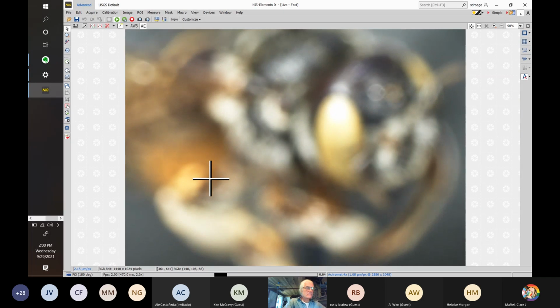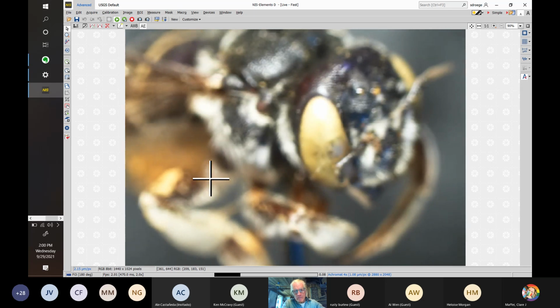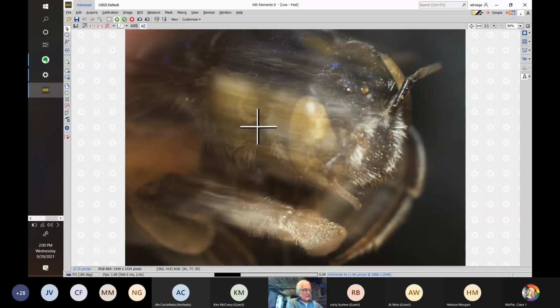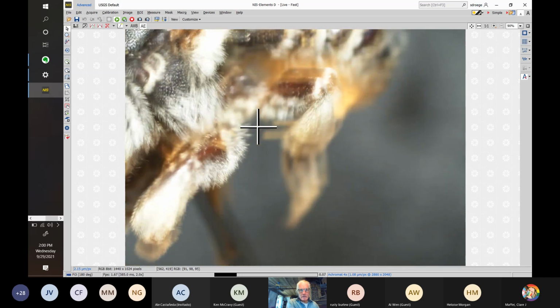See if we can get a better view of that area. Paula shared that they have one male and one female occidentalis out of Durango, Mexico. Okay. Well, looking at it from this direction, there might be a sharp transition. I can't quite tell, and it's not mentioned in the guide, but it looks like it might be relatively sharp, but it doesn't have these other features that Dianthidium has. And I'm not convinced that there is a sharp transition, looking at it from this side.